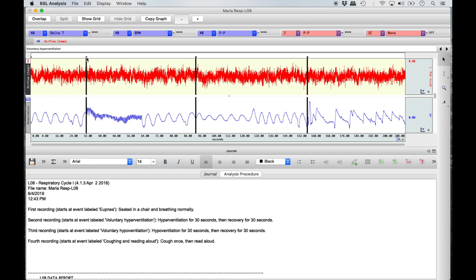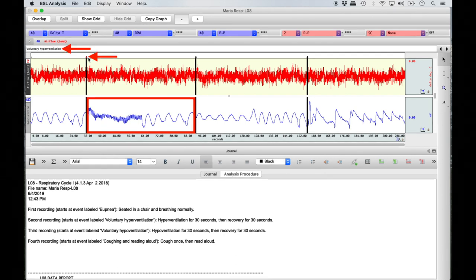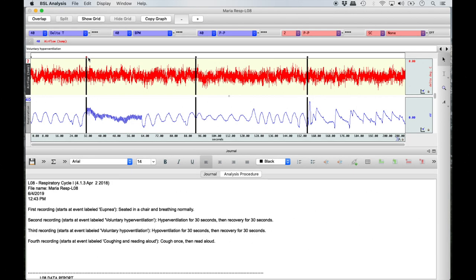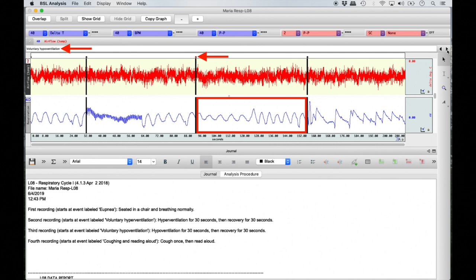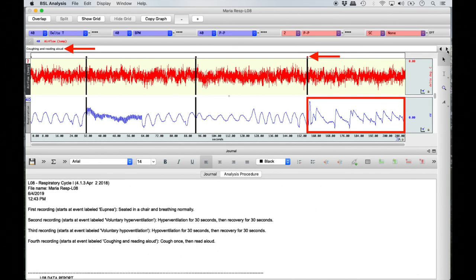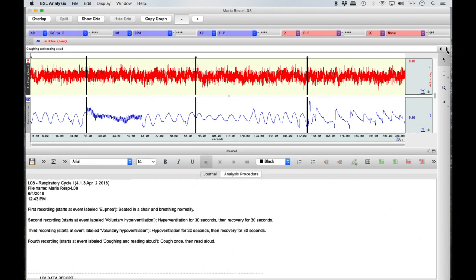If you click on the next event marker you will see the hyperventilation condition labeled in the top text box, and everything to the right of that vertical line represents the hyperventilation experiment. Rather than clicking on individual event markers, you may also move along conditions using the right and left event arrows on the far right of the screen. Use the left event arrow to move all the way back to the eupnea condition.